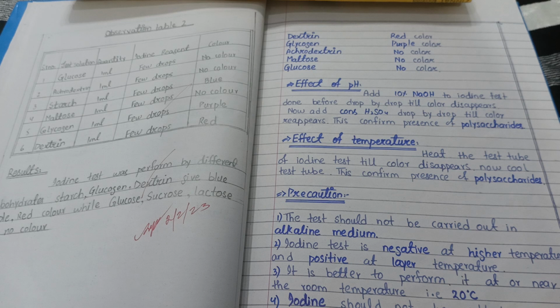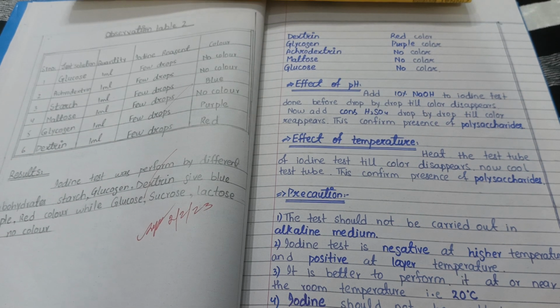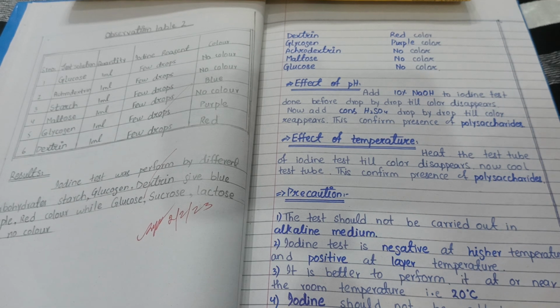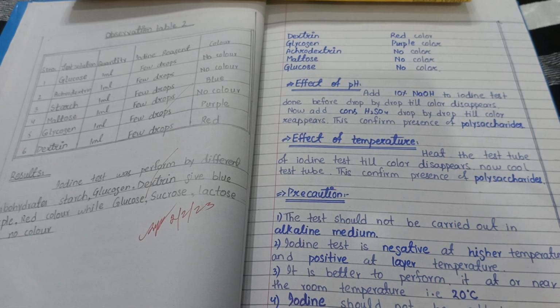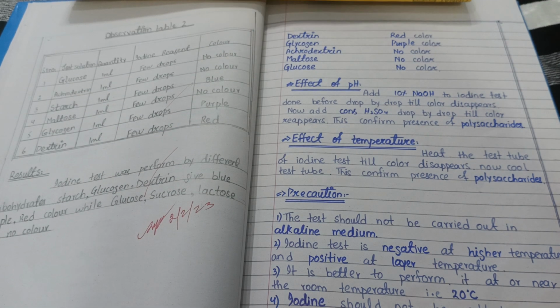Now this test has some effect of pH and some effect of temperature. For example, in the effect of pH, it is written that whenever you add base to it, for example 10% NaOH, you will see the color disappear. This happens because you are adding base, and I have explained to you that base is not suitable for this reagent. And if you then add concentrated H2SO4 to it, you will see that the color reappears. So this also confirms that polysaccharide is present.